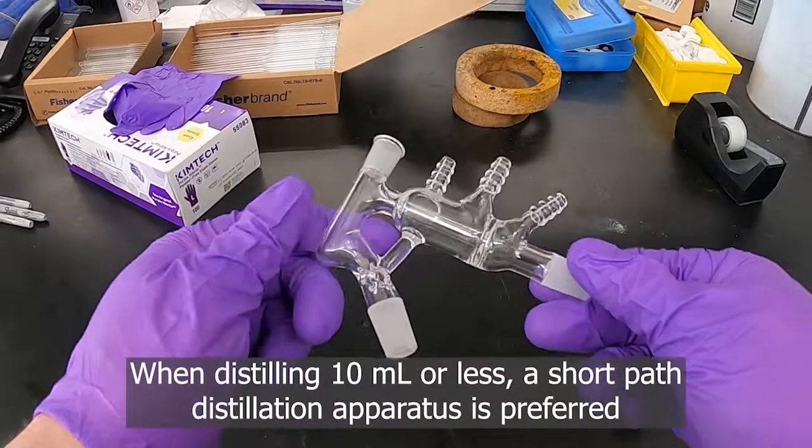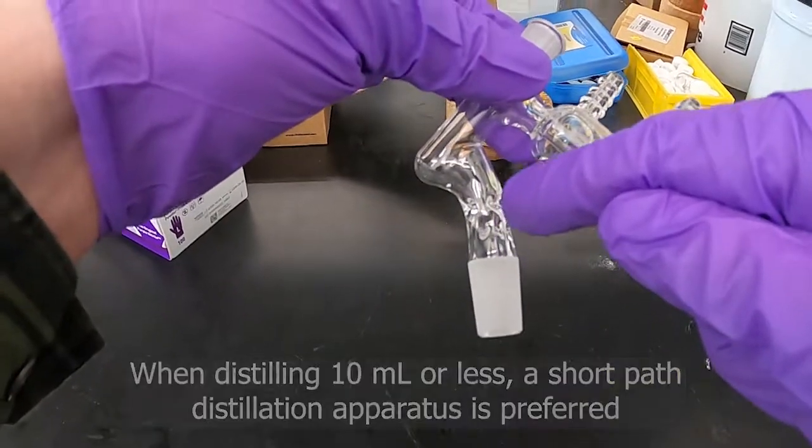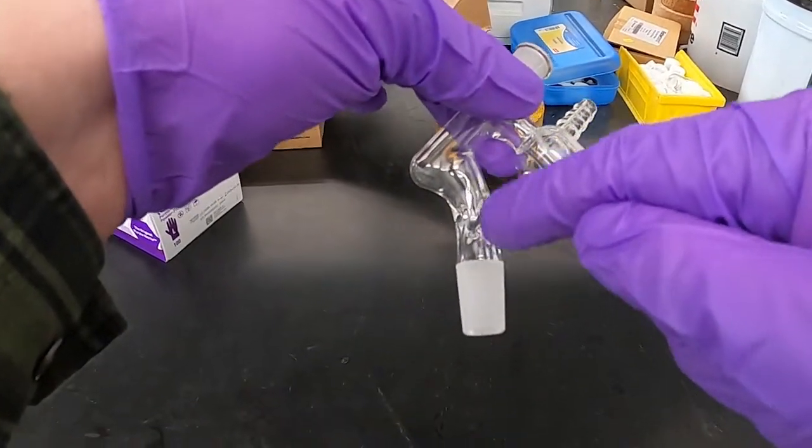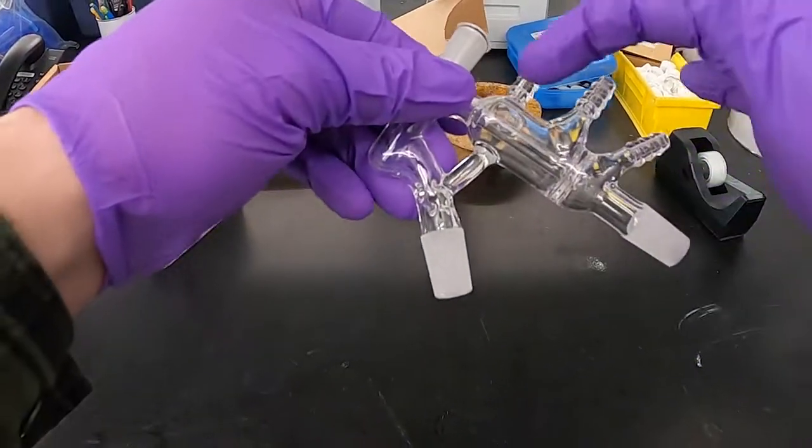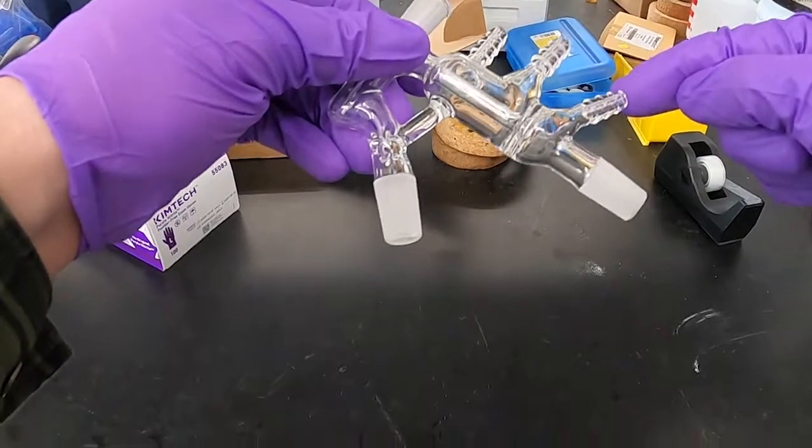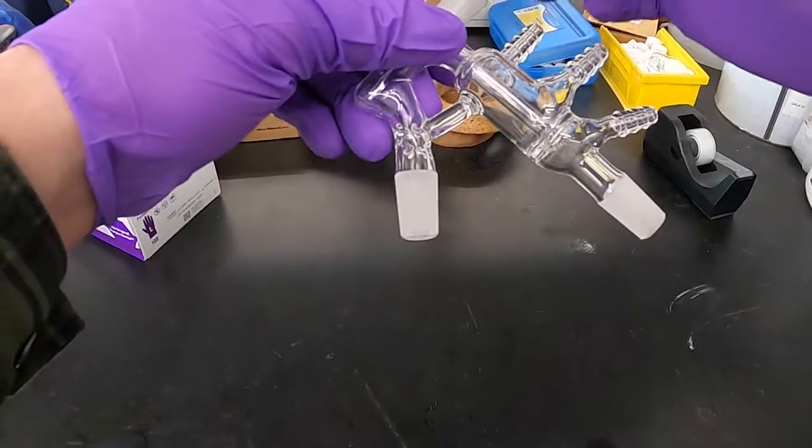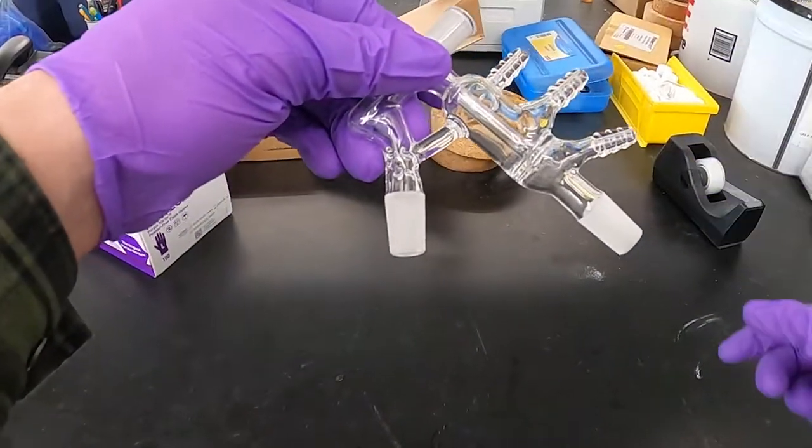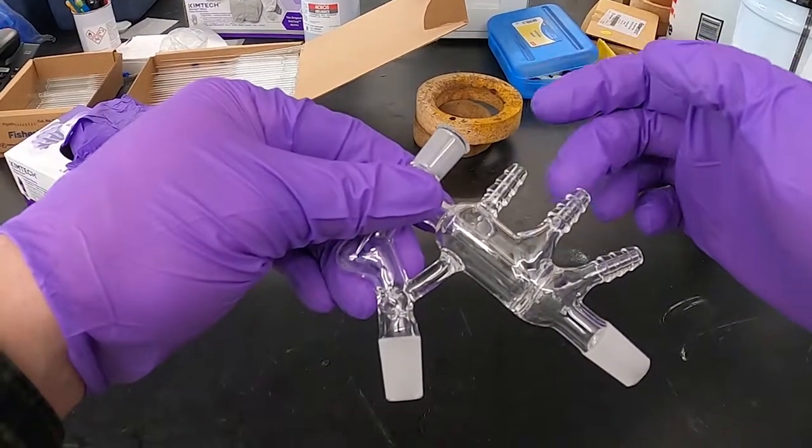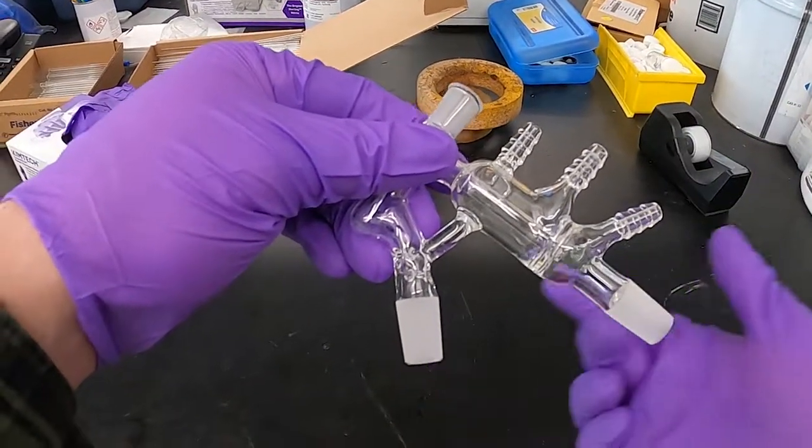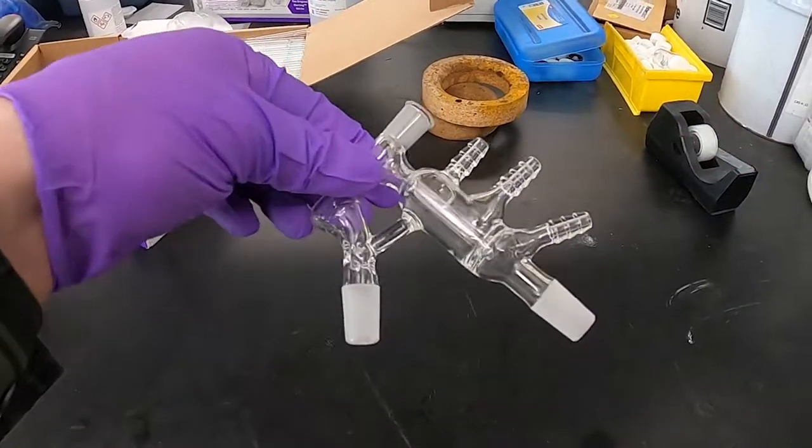Here's an example of one of those really small short path distillation setups. You can see here there's some little fingers, this has got a bit of a Vigreux type column to it, and then some more space to cool things and even a small portion that can be a water jacket, your vacuum adapter, and then ports for your flasks to distill from and to collect into, and then space for a thermometer. So this is probably the smallest that you can get.